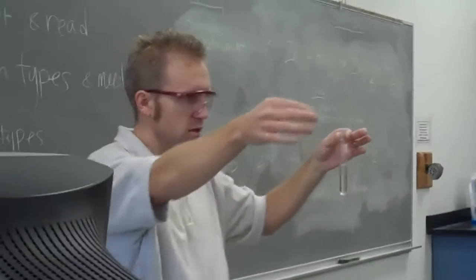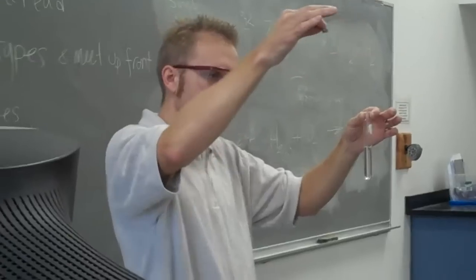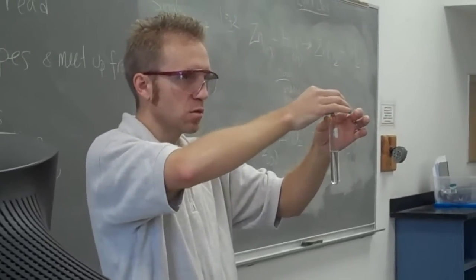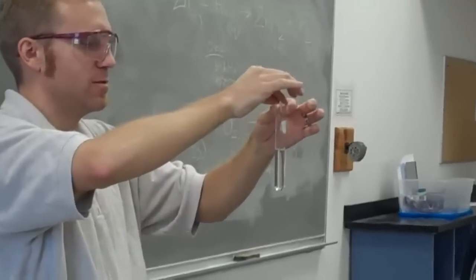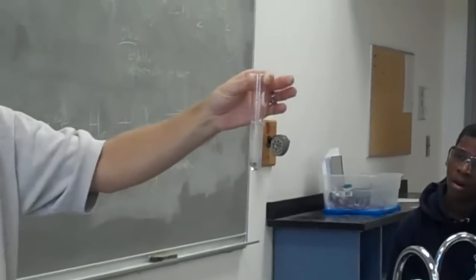Ready? All the zinc. Putting the zinc in. This is the first of the two reactions. What did you predict? Bubble and exothermic heat. Bubble.